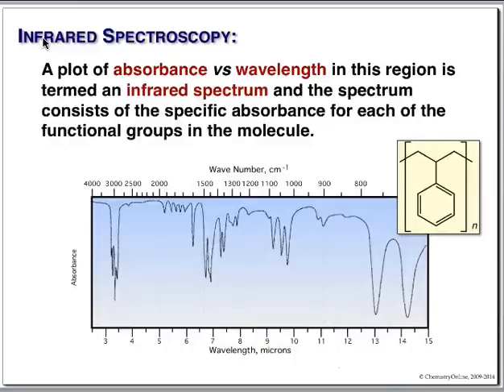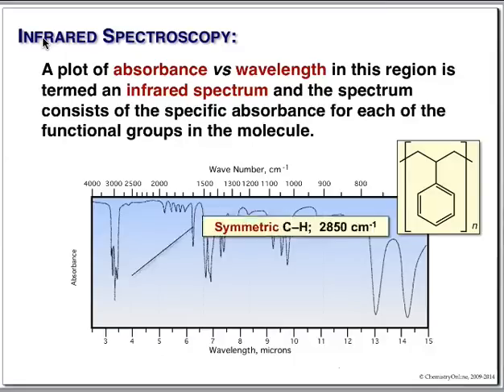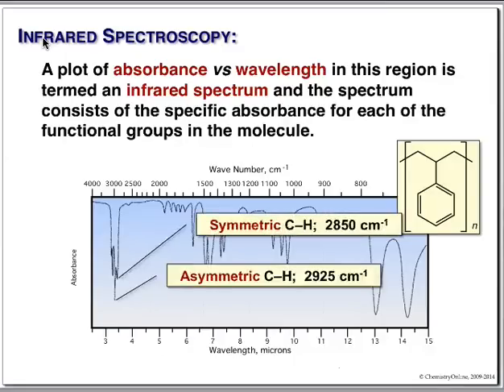So in a much more manual machine, you would adjust your printout, if you will, so that this occurs at the exact wavelength. These are all absorbances as a function of either wavelength or reciprocal centimeters, wave number. We talked about the symmetric and asymmetric stretches. Here we have the asymmetric and the symmetric, again about 2900 and 2800 reciprocal centimeters.